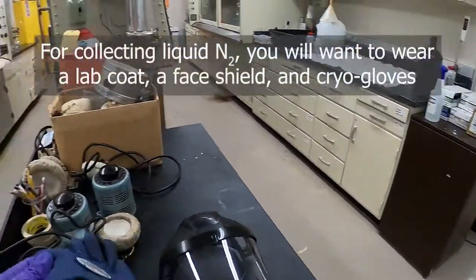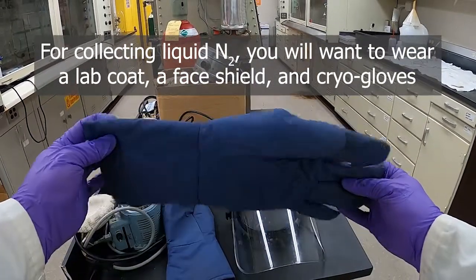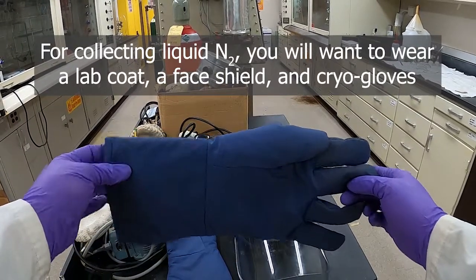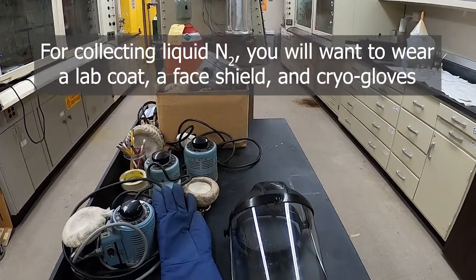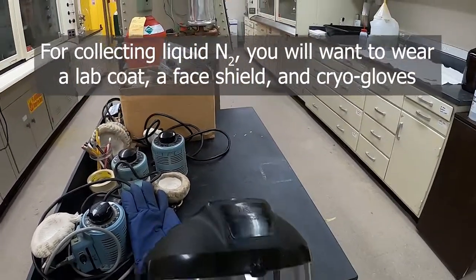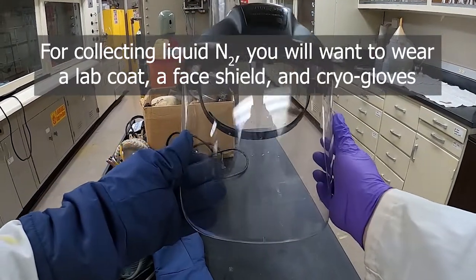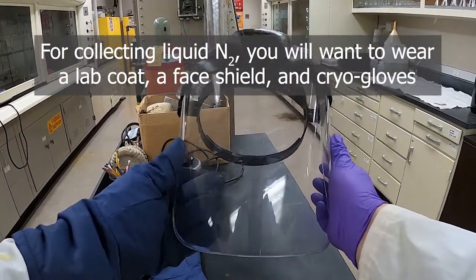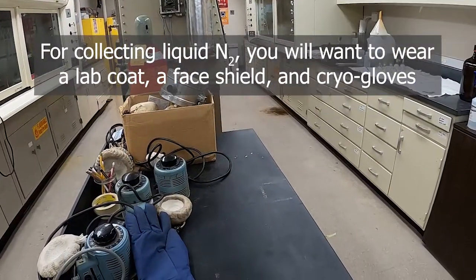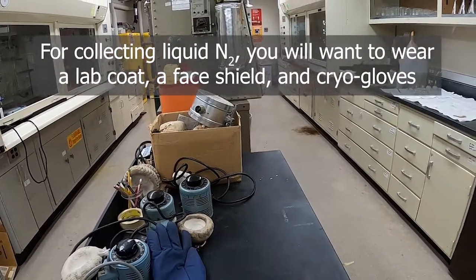We need some PPE when dealing with liquid nitrogen. We have these cryo gloves — they'll help protect your hands from the cold. Go ahead and put those on. Then this face shield to protect us from splashes and provide extra protection. Of course you'll be wearing goggles or safety glasses as well; goggles are a better idea and are required for this lab.